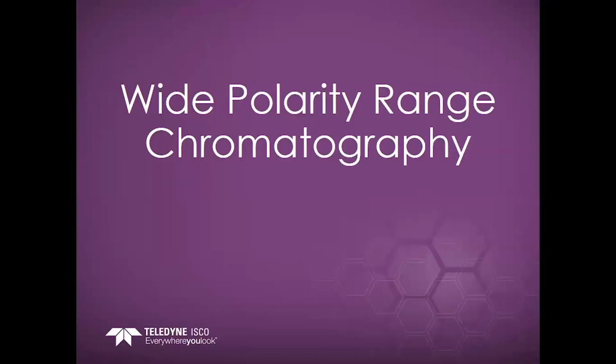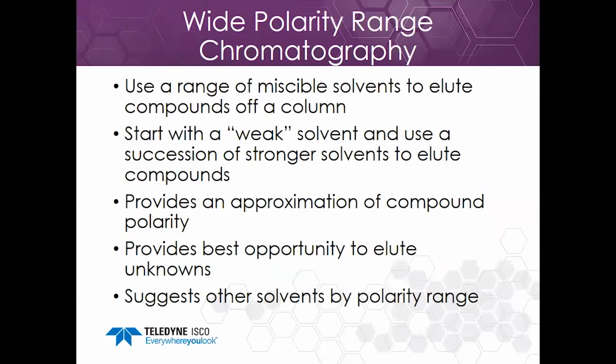The other thing I will discuss is wide polarity range chromatography. Wide polarity range chromatography uses a range of miscible solvents to elute compounds off of a column. You start off with a weak solvent and use a succession of stronger solvents to elute compounds. The reason why I would do this is it reduces greatly, almost eliminates the chance that I will leave an active compound on a column.